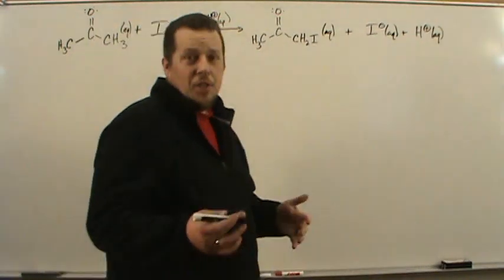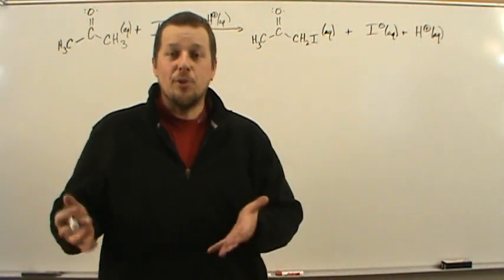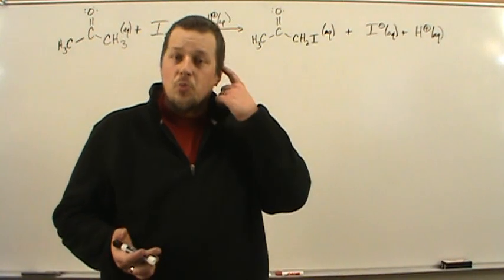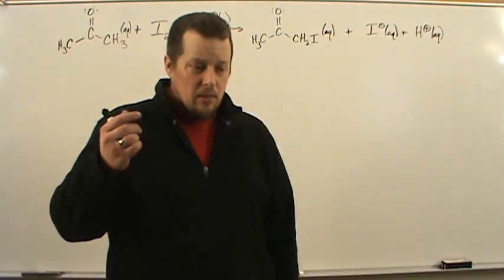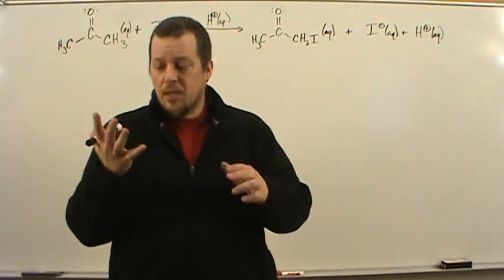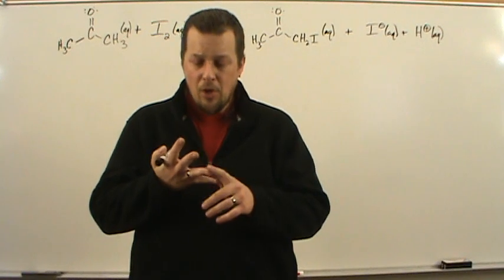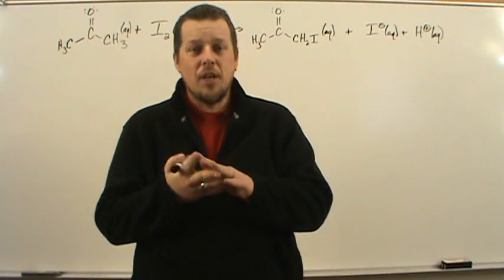To figure out activation energy, we need to use the Arrhenius equation. And for this experiment, we can use it a few different ways, because we've got 3 different temperature conditions, which means that we could use the comparative form a couple times, and we can also use the linear form.